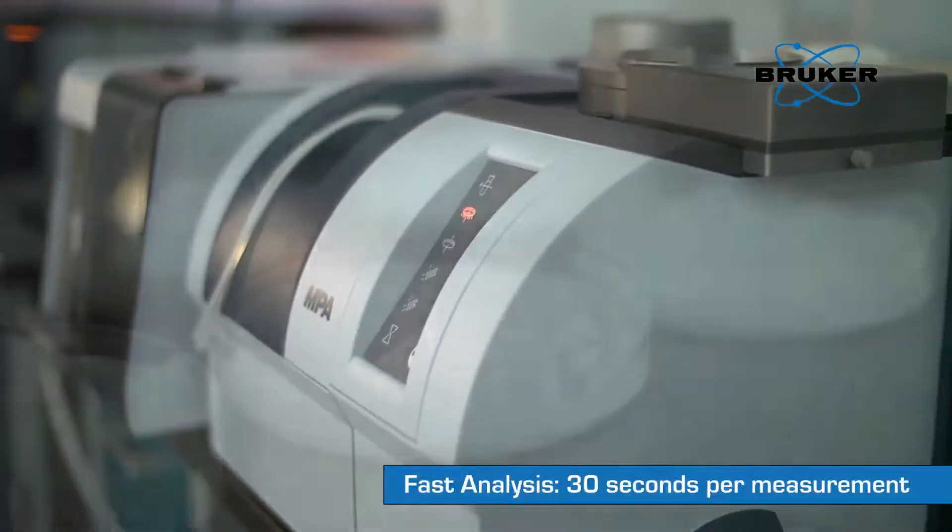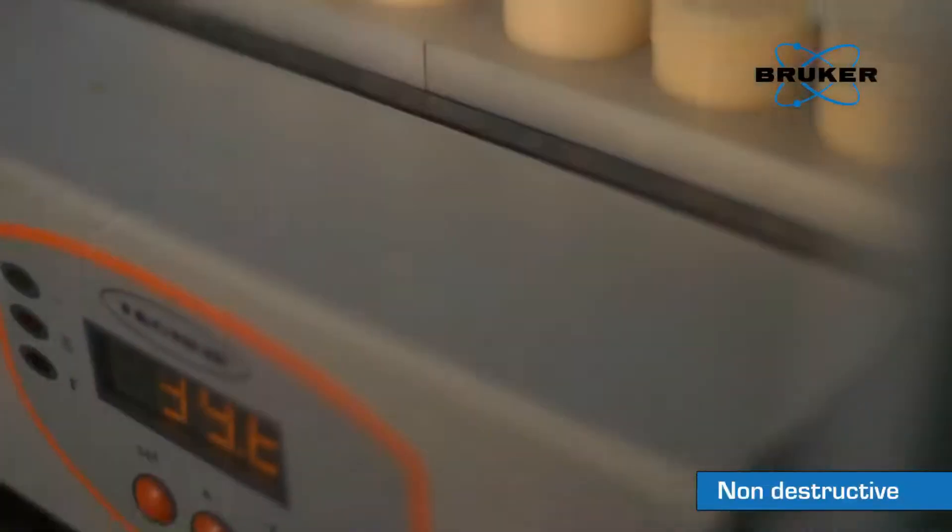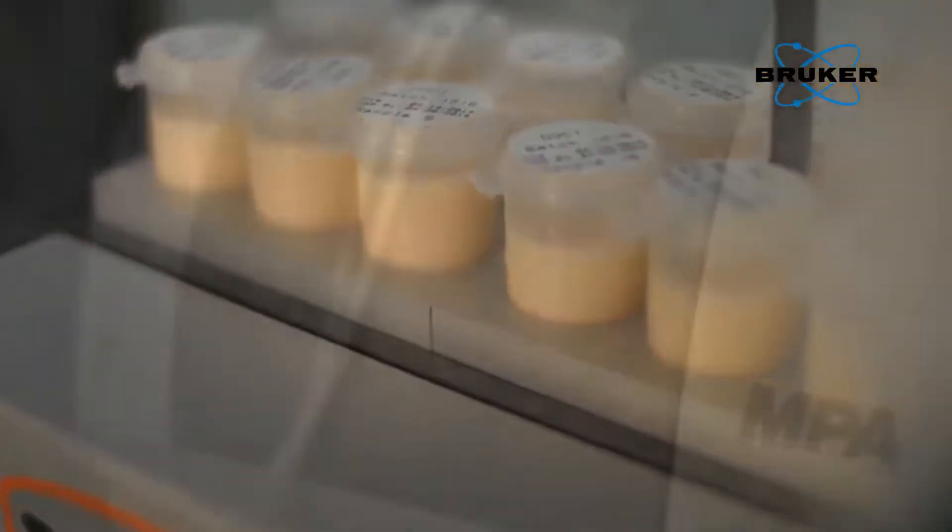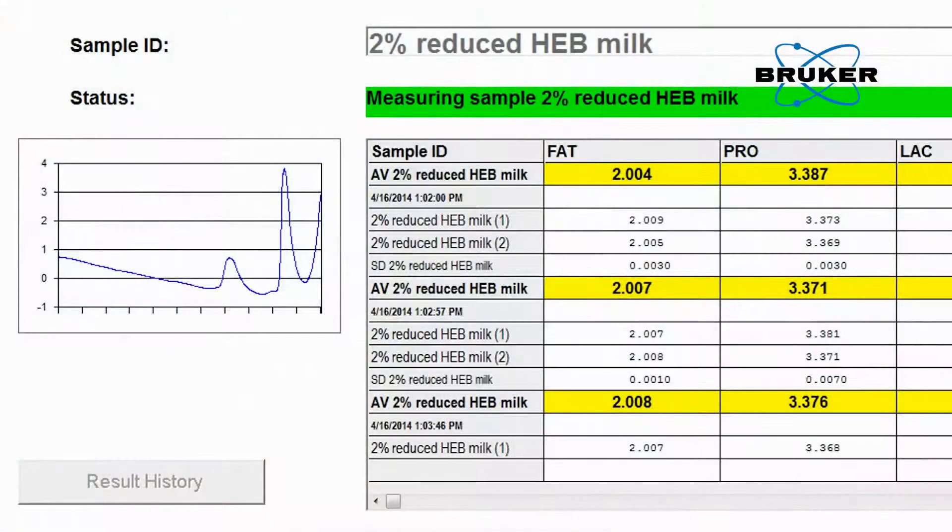The Bruker MPA Dairy System is configured to test the full range of dairy products, providing simplified routine testing without the need to cross-train on multiple instruments, faster ROI with minimal risk, and actionable data from start to finish to support lean manufacturing and Six Sigma initiatives.